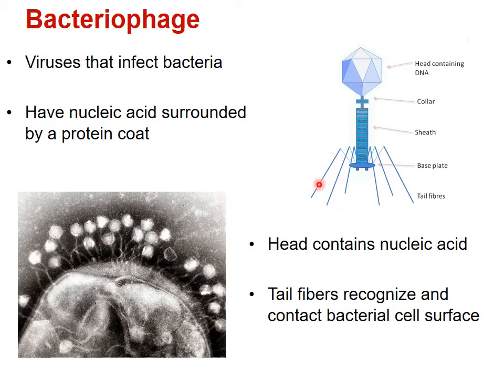And the recognition is going to happen at this end, and the bacteriophage will bind to the cell, as shown here. You can see the capsid and these sort of long tubes interacting with the bacterial cell down here, and they will inject their DNA into the bacterial cell.